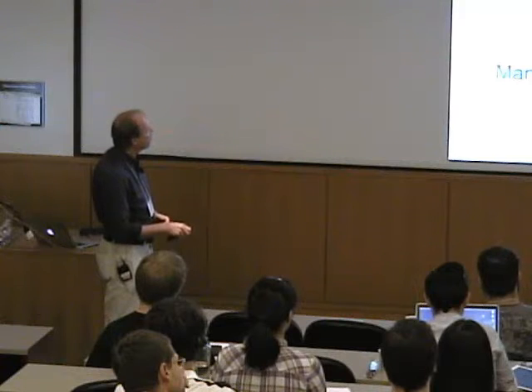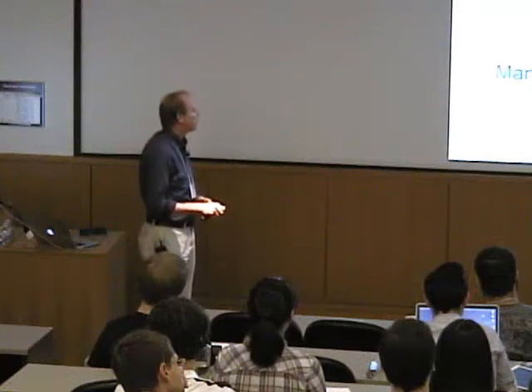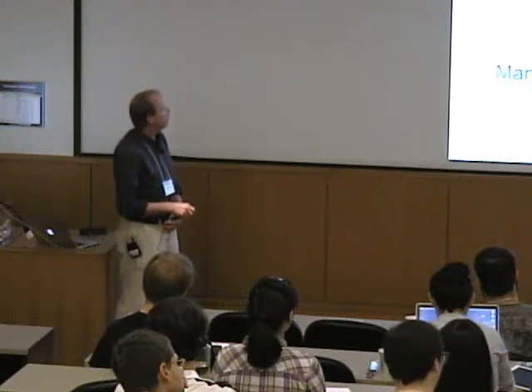And then we put our sample in the part of the resonator where the magnetic lines of force are strongest. And this focuses the part of the microwaves that's absorbed by the sample onto the sample, so that it increases the amount of interaction here, right? As we'll see a little bit later, what we then measure is actually not directly the absorption, but the effect on the resonator, right? When the absorption occurs, we get a disturbance of this resonance, and it's that disturbance of the resonator that we actually measure.